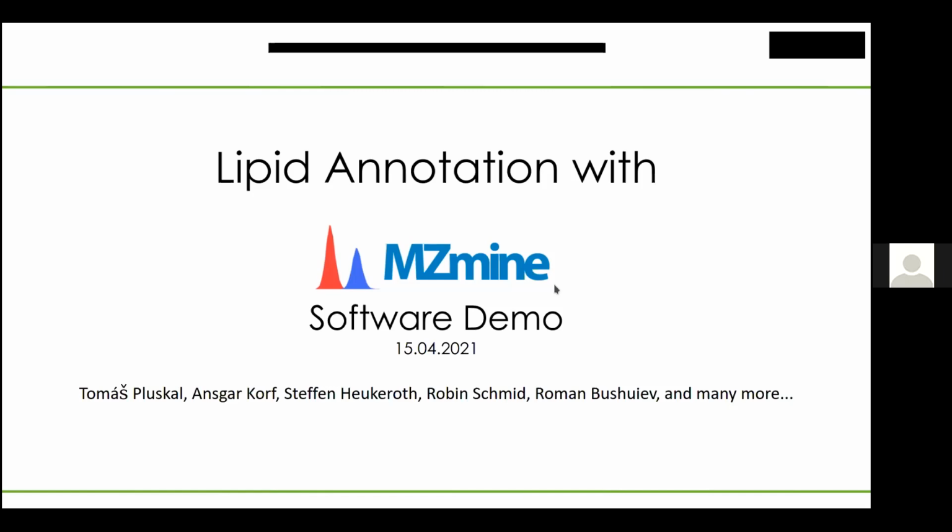So what's the scope of this presentation? I will give you a brief overview of the history of MZmine. Then I will give you a short theoretical approach to how an LC-MS data mining workflow should look. But I want to spend the main time on a live demo where we can do data mining in MZmine for various data types, so not just liquid chromatography, but also other techniques. And then I want to focus, of course, on the annotation of lipids.